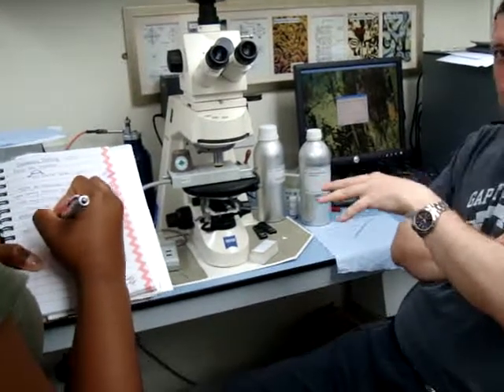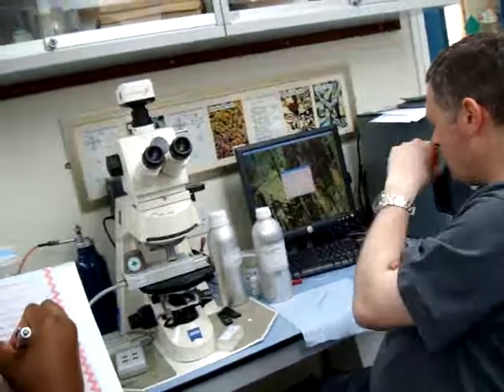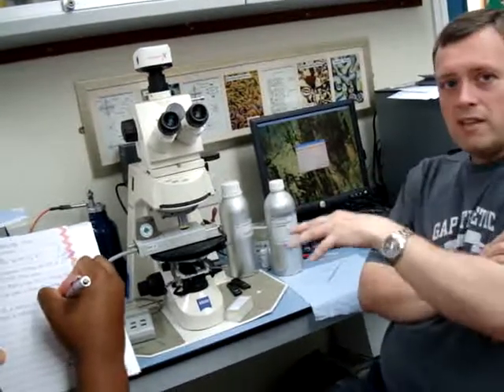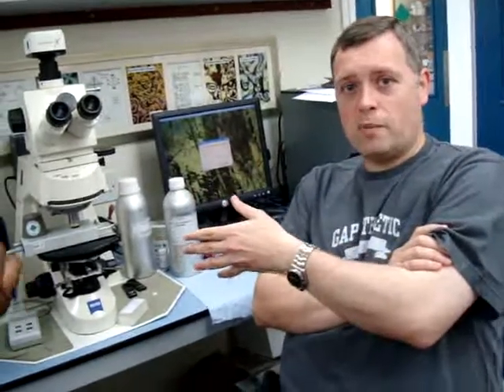Obviously, if you've got a sample that's solid, you're going to stick it on there, look, and determine the melting point by heating it up carefully. But as I say, once you are in the liquid crystal phase, keep heating up until you get into the isotropic liquid. But there's no point in trying to determine what phases you've got until you are cooling back down.